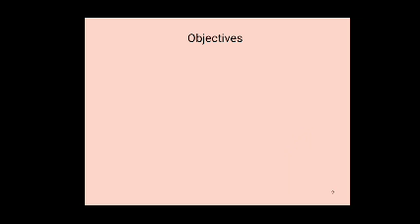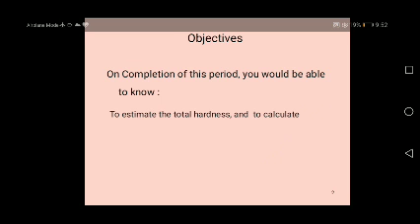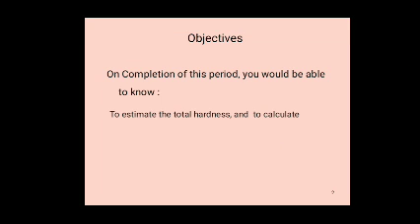Objectives. On the completion of this period, you will be able to estimate the total hardness of hard water by calculating it using CaCO3 equivalent weight.